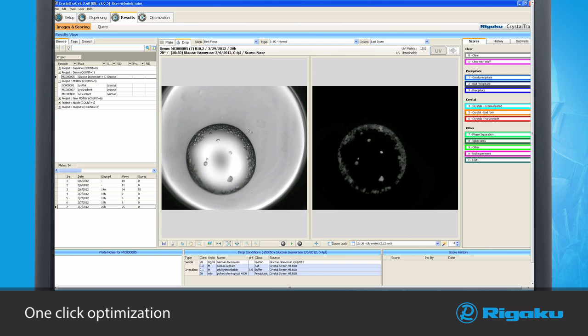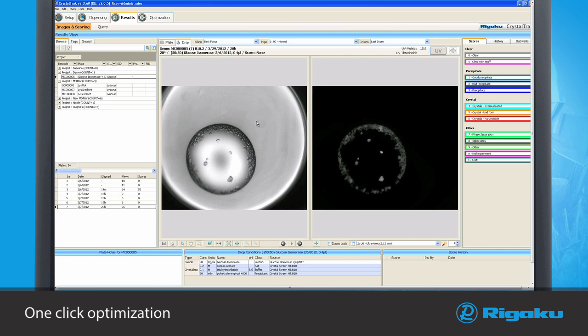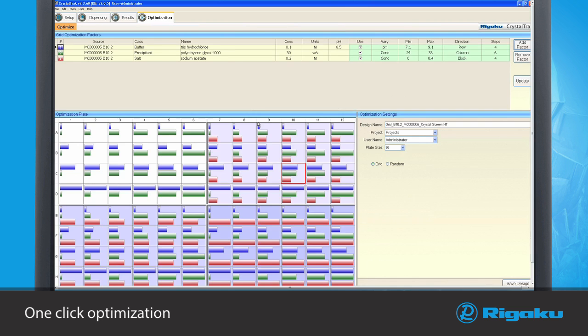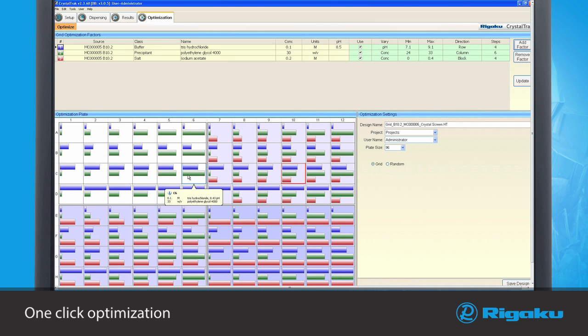Using Rigaku's one-click optimization, simply right-click on any image or images for immediate optimization refinement. One-click optimizations can also be adjusted to meet specific design of experiment goals.